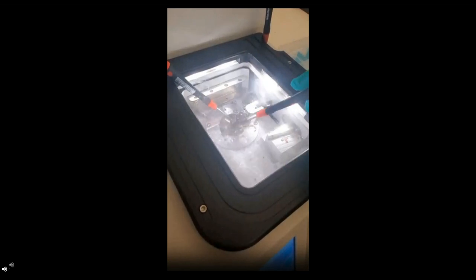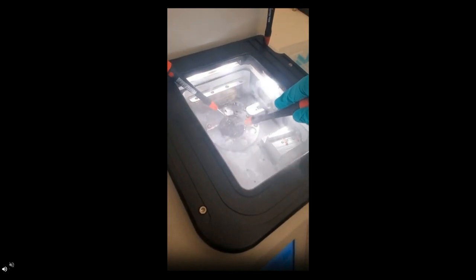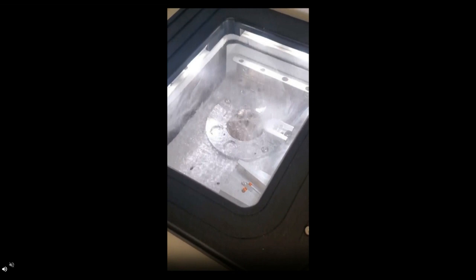So here we are just plunge freezing the whole setup into LN2 and waiting for it to stop bubbling. And then this is using the VCT. You'll see the grabber tool come in, grab the shuttle, and pull it back, and then we need to do a little bit of gymnastics with the sample dimensions, and then that goes under vacuum and gets transferred to the SEM.